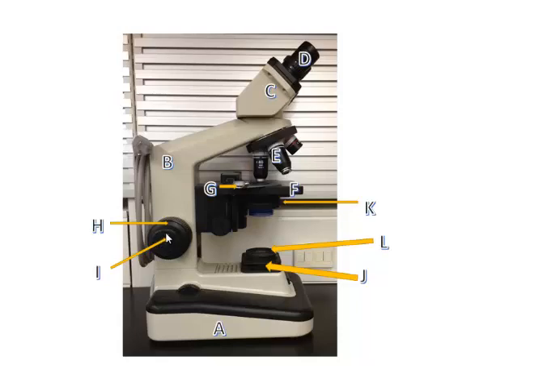This is the fine focus knob. You make small changes in the focusing of the object. This is the one you use to fine tune your focusing on the lowest objective lens, but then you can also use it on the higher objective lenses to make sure that you get the best focus that you can.